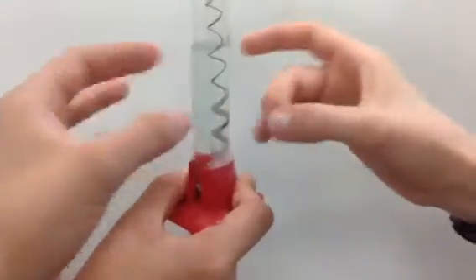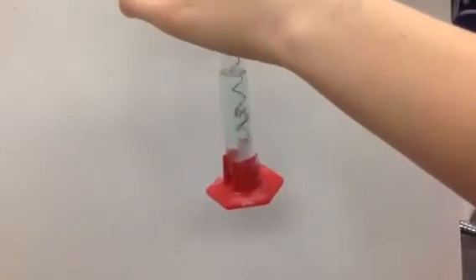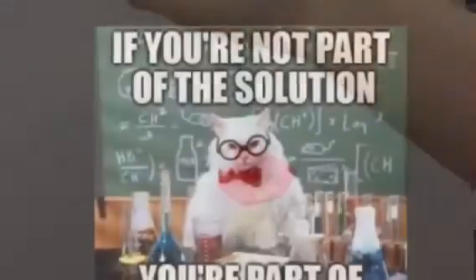Eventually, enough silver has collected that we must knock away the silver in order to expose the copper to the silver nitrate so that more can react.